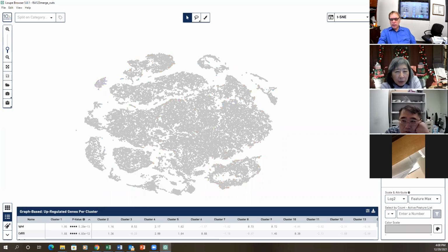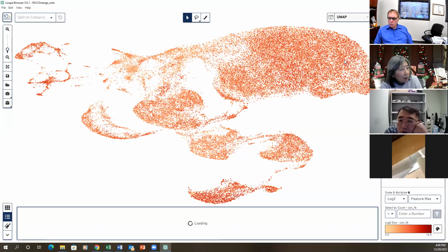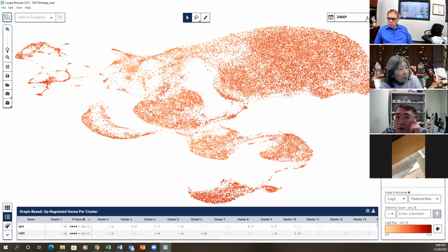Right, so I'm going through the total seq part. Okay, so Shanruns said you just type in control, and then control and KO show up. Right. So it's kind of all over. But then for KO you can see the color is different, darker. You don't use tSNE, you change the UMAP, the last one, antibody. Huishan, you must be using an older version somehow. Oh, really?